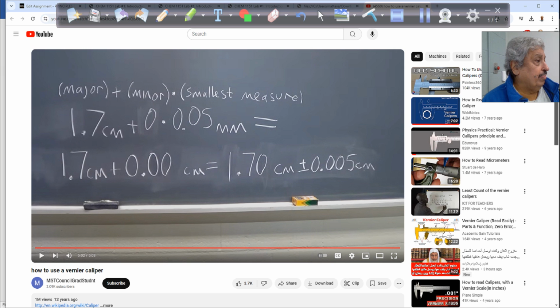Please do not drop them on the floor. If they are dropped on the floor, they might get cracked a little bit on the surface, and that will affect the diameter, your diameter measurement. So be careful. Just be careful dealing with those, so we don't lose the real diameter for them.